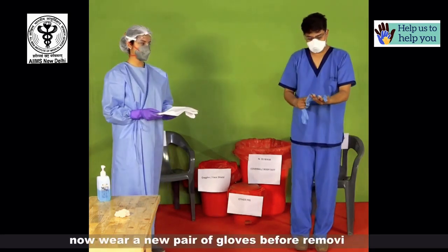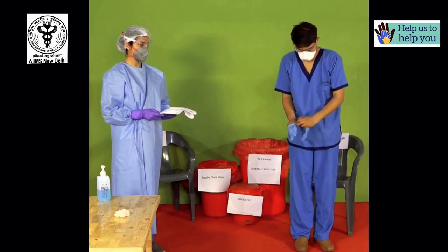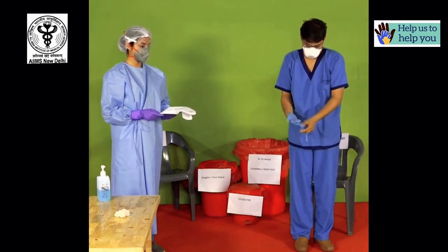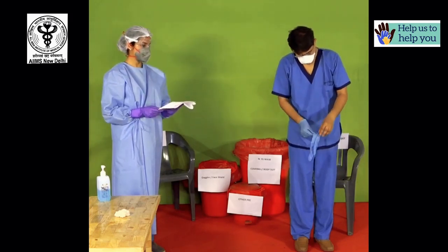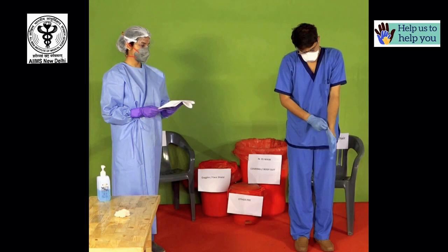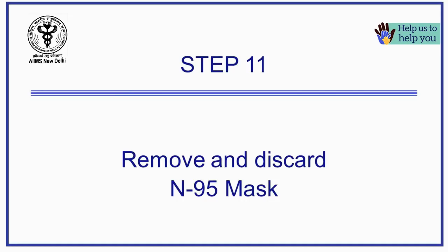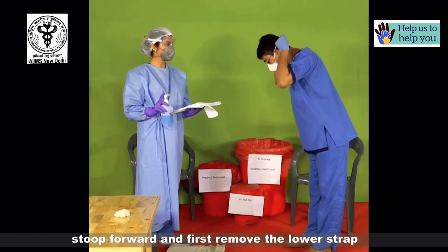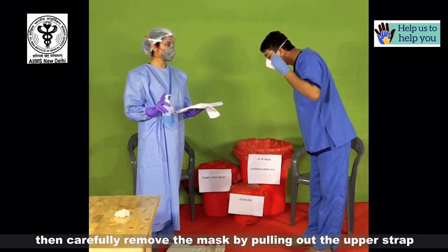Now wear a new pair of gloves before removing the mask. Do not touch the exposed surface of the mask. Stoop forward and first remove the lower strap, then carefully remove the mask by pulling out the upper strap.